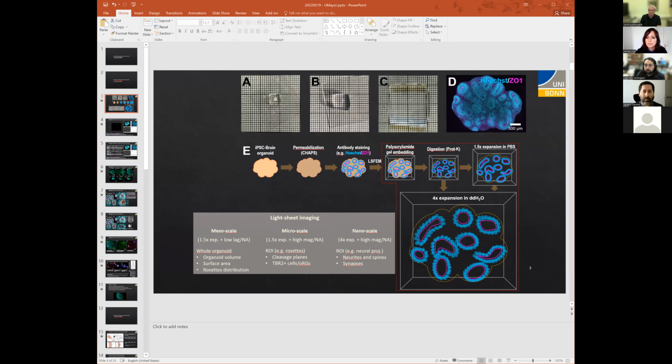So if I'm working with brain organoids and I would like to do imaging, and I cannot do either this expansion or clarity, do you think that is a big problem to perform these experiments? Maybe doing light sheet microscopy is not the best idea? Maybe with that 2-photon light sheet. And up to a given size, it will work very nicely.